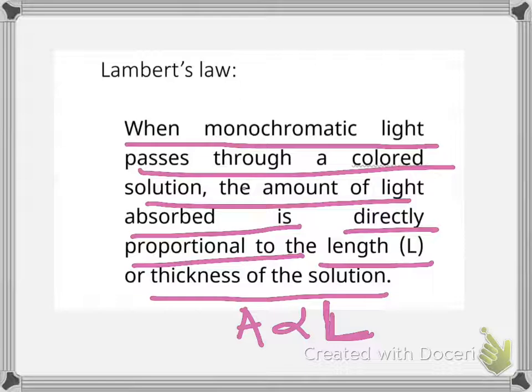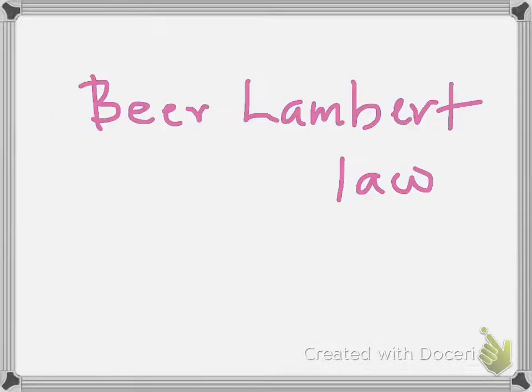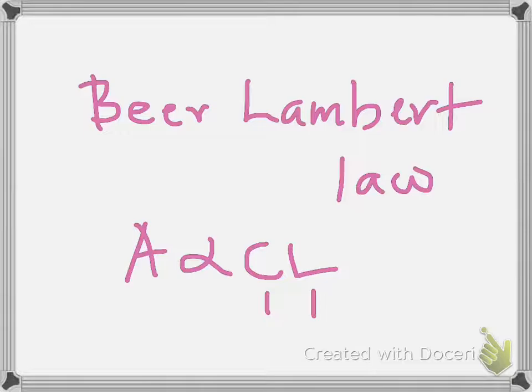Combining these two laws, we get the Beer-Lambert law. That is, A is directly proportional to C L, where C is the concentration and L is the path length.